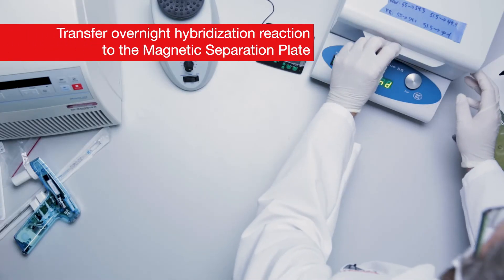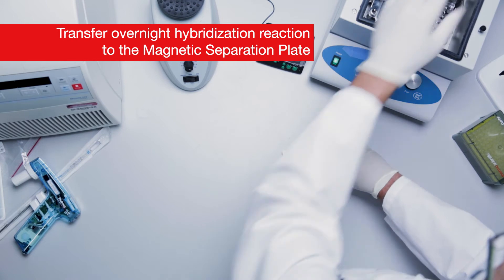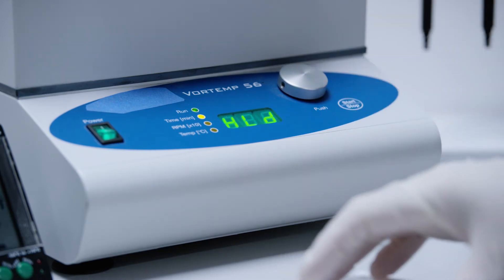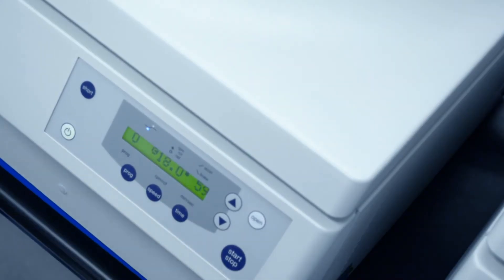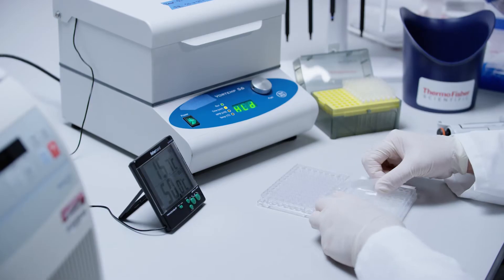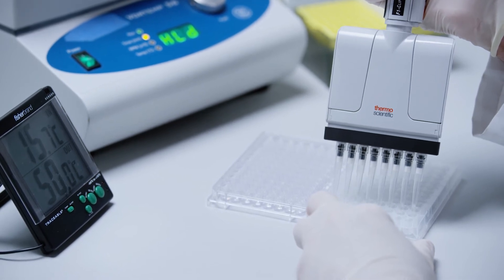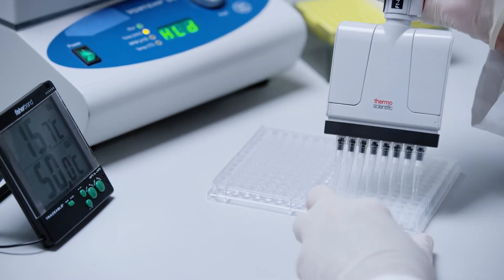Remove the hybridization plate from the shaking incubator and adjust temperature to 50 degrees Celsius plus or minus 1 degree Celsius. Restart the shaking incubator and leave it running. Centrifuge the hybridization plate at 240 G for 1 minute at room temperature. Remove the pressure seal. Pipette up and down gently 5 times and then completely transfer the entire contents of each well from the hybridization plate to the magnetic separation plate, which is a flat bottom plate. Make sure to change tips between columns.